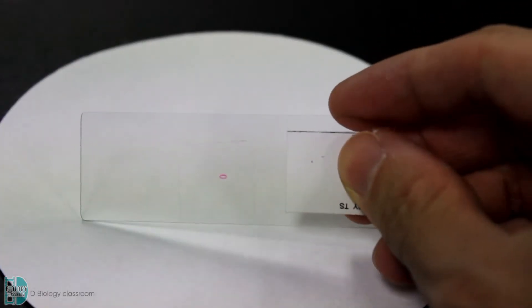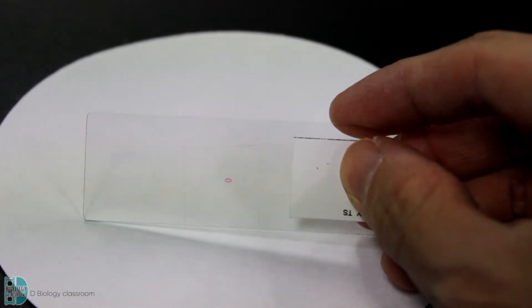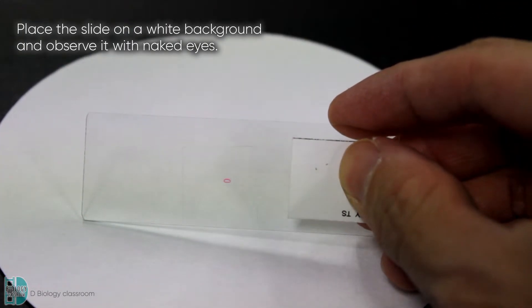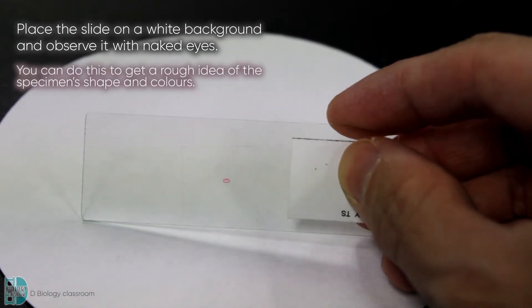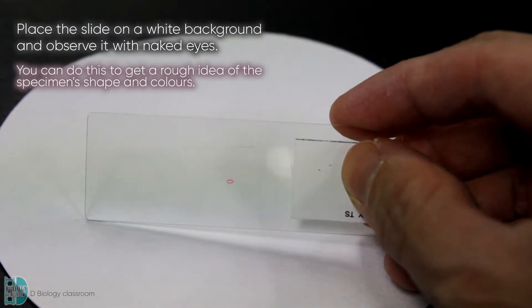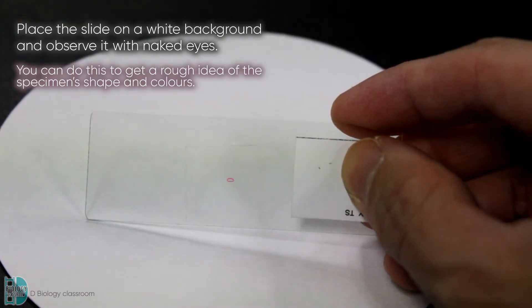Before viewing the slide under the light microscope, it is a good idea to place it on a white background and just use your naked eyes to observe it. I always do this to get a rough idea of what the specimen's shape and colors are, so I know what to expect later. You can also hold the slide against the ceiling light for this purpose.